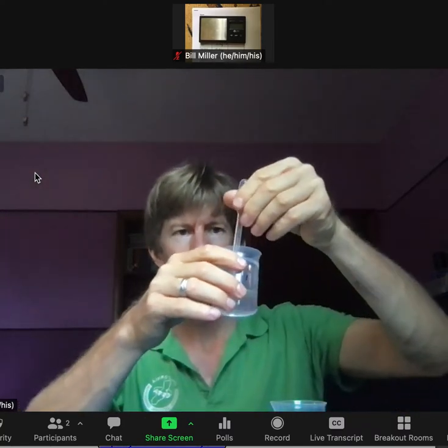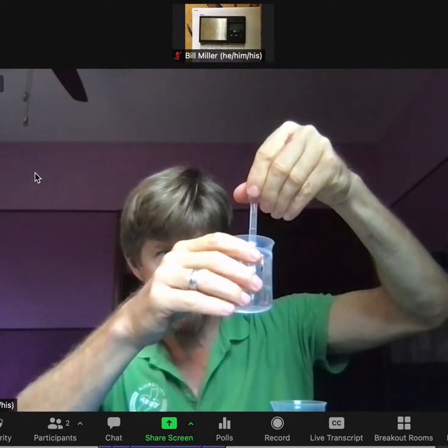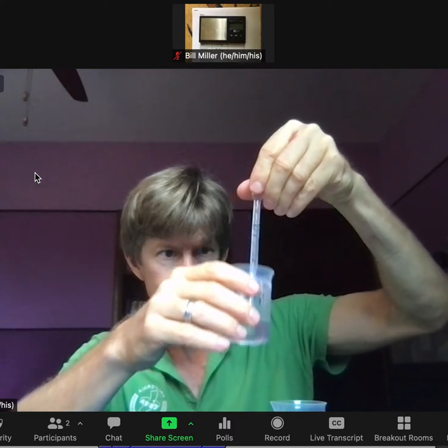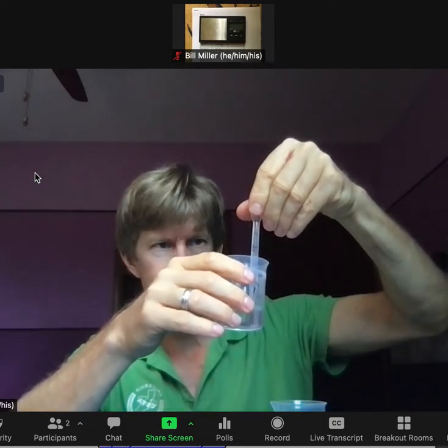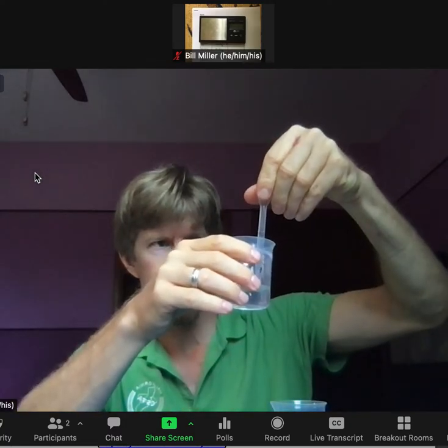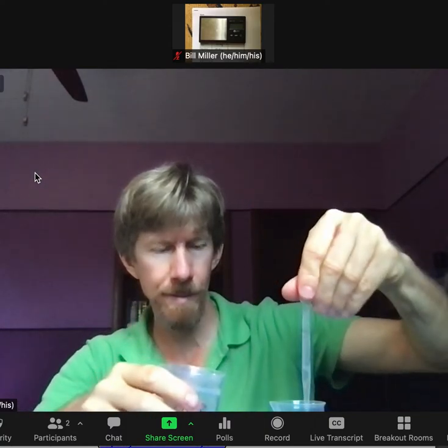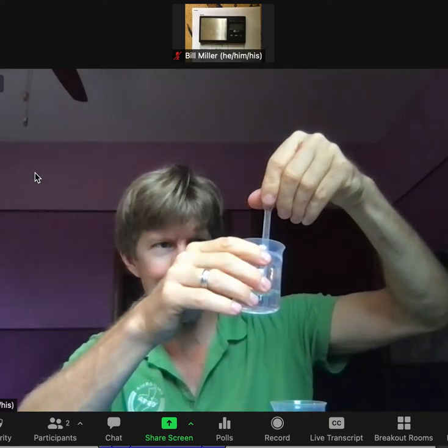That's 30 milliliters of my solution measured. Going back to read the procedure. I notice I forgot to condition my pipette — that's an error I made that will throw results off a tiny bit, because I used a different pipette previously. I needed to condition it.